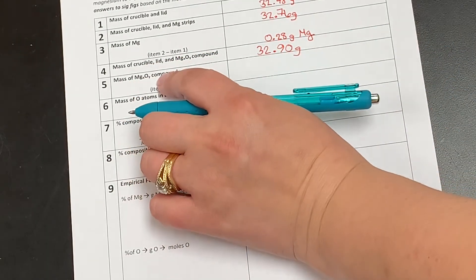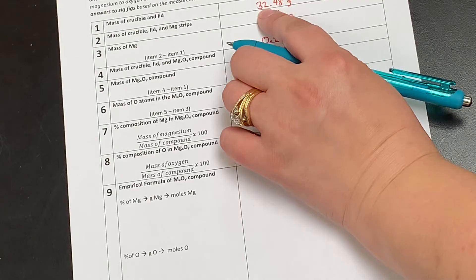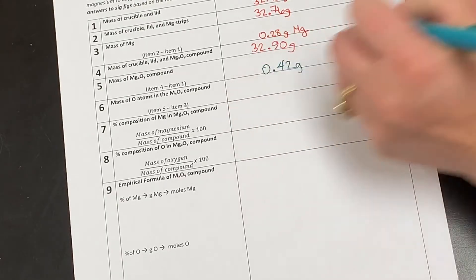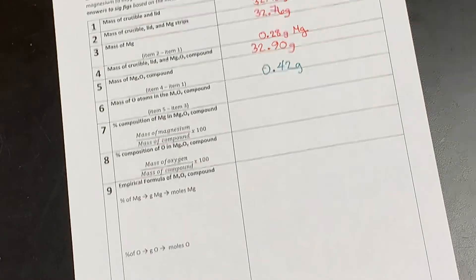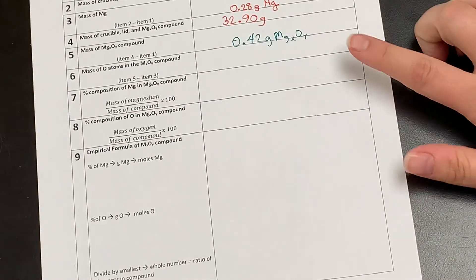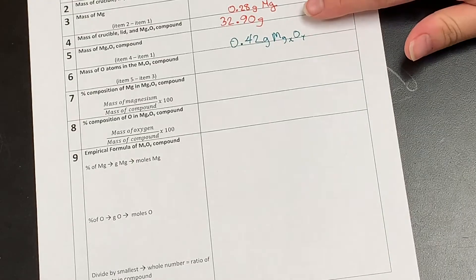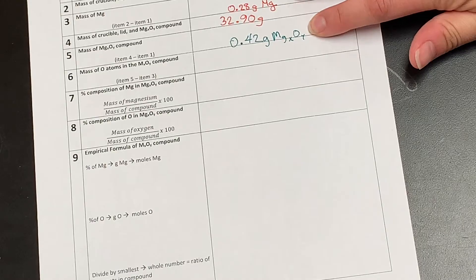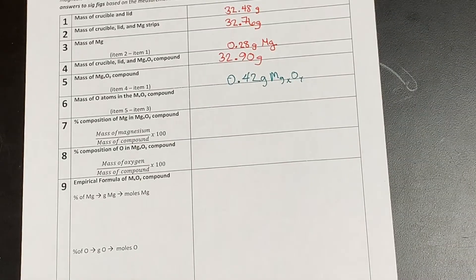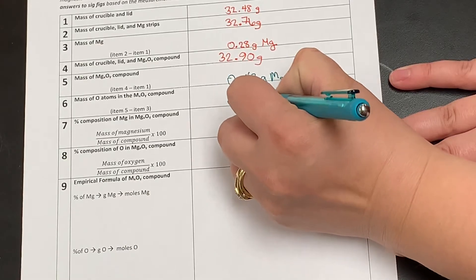To get the mass of the MgXOY compound, we are going to take the final mass of 32.90 and subtract the mass of the crucible and lid, which was 32.48 grams. That gives me a mass of 0.42 grams of the compound. The next field asks me to figure out the mass of the oxygen atoms in the compound. So I'm going to take that 0.42 and subtract out the 0.28 grams of magnesium, which gives me a mass of 0.14 grams of oxygen atoms.